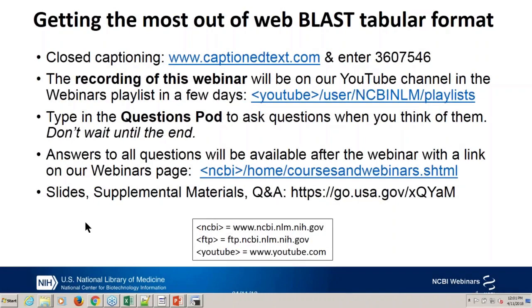Okay, good afternoon, everybody. This is Peter Cooper again. This is a webinar on dealing with one of the WebBlast tabular formats.